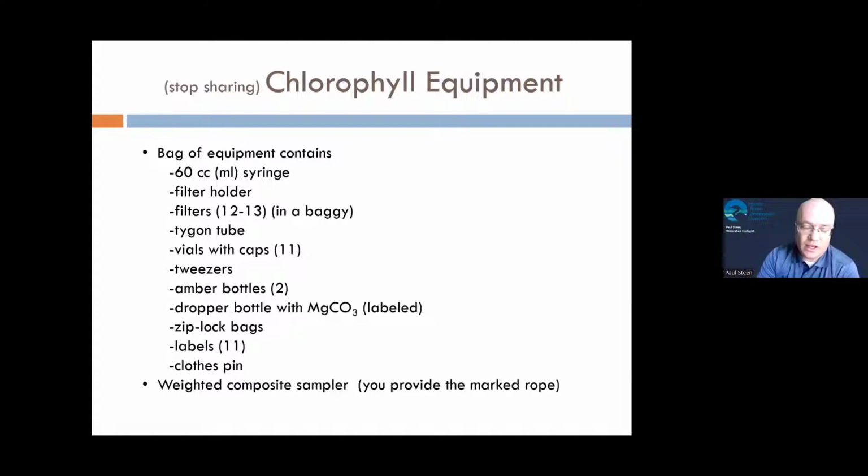Now, this is only the case for people who are brand new. If you're a repeat chlorophyll sampler, you will have a lot of this already, and we don't give you all this stuff over again. Instead, we just give you the consumable pieces that get used up every year.